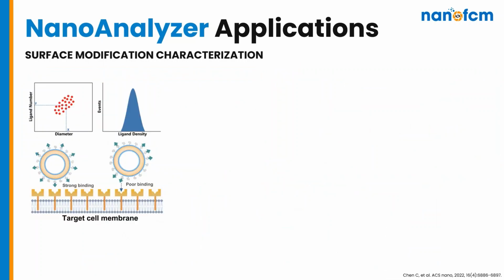So we've looked at a couple of examples already that deal with LNP cargoes and their detection. Let's here look at surface modification of particles and detection of ligands that are supposed to be displayed on their surface. And we can think of this just like we might think of a cell. In the particle, it has a certain number of targets available. Different formations may lead to different display of them on the surface and their evenness. It may lead to different numbers.